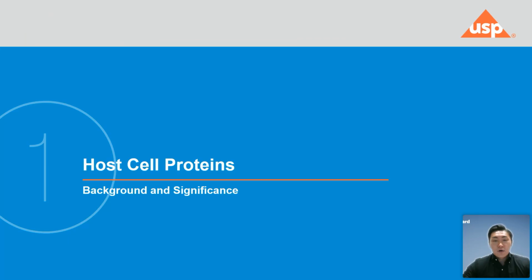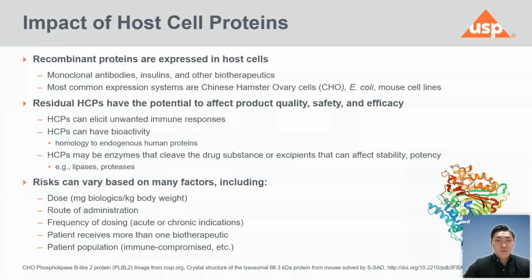Now, let's talk more about host cell protein. So why do we care about host cell protein? Well, obviously, if you're in this webinar, you already probably do a lot of characterization and measurements with host cell protein, or you're doing bioprocessing, trying to get rid of certain problematic host cell protein.